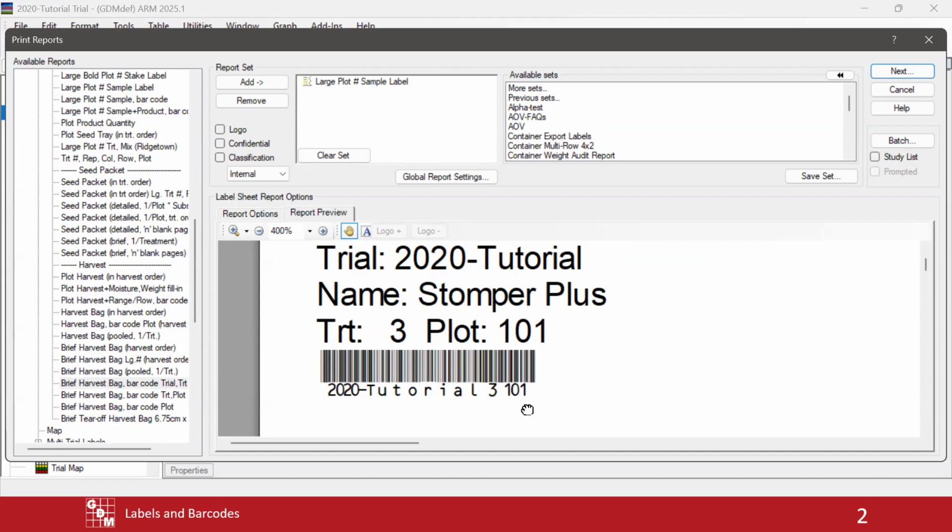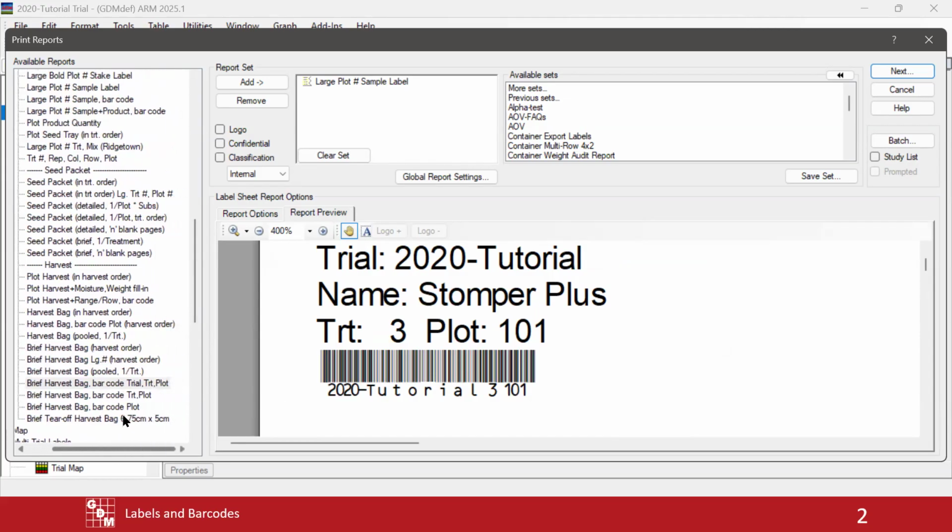The way barcodes work, it really is just text that is converted into a barcode. So the question with the label is, what is the content of the barcode? What does it say? That is written right underneath here. Depending on what you want, in this case, the name actually tells me.